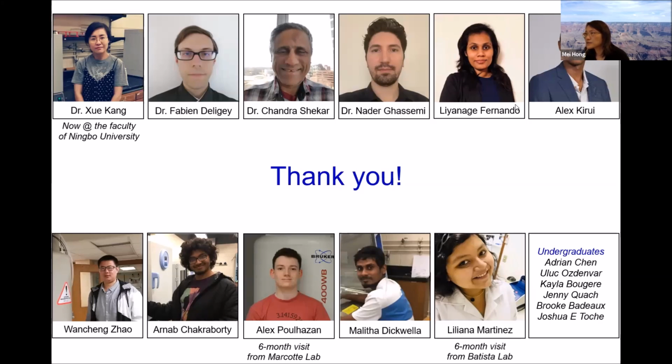All right, good. Next question is from Tanguy Lebron. Thank you for your very interesting presentation. Can specific labeling of carbohydrates reduce the complexity of 2D carbon-13 spectra? Yeah, we just purchase specific isotopes. Good question.